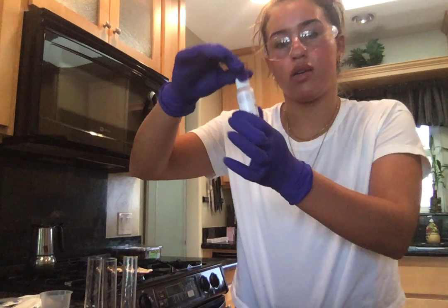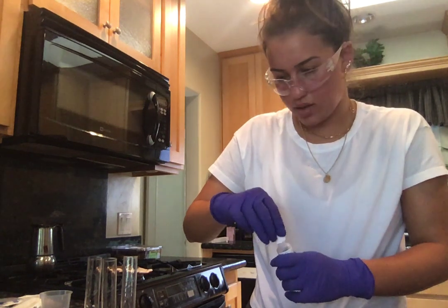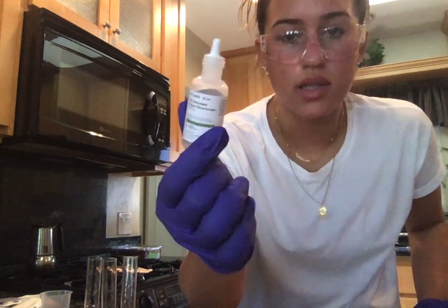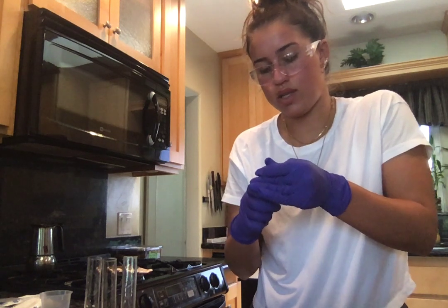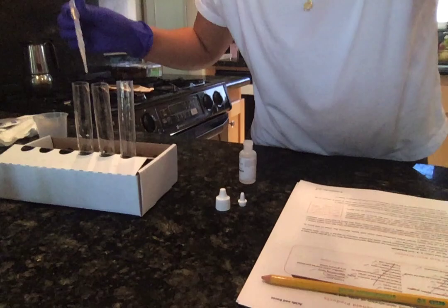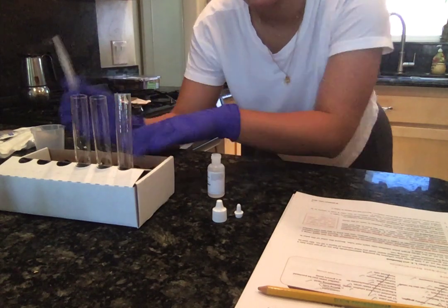So here's my saturated sodium bicarbonate. And this one does have a dropper. So I'm not going to use a pipette only because this doesn't come off. Oh, it does actually. I'll use my pipette then. So now I'm going to do the same thing and I'm just going to put 15 drops of this saturated sodium bicarbonate into test tube 2 right here.